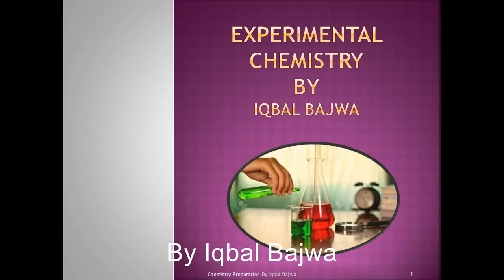Students, today our topic of discussion for O level is experimental chemistry. So you all are familiar with the lab and lab practicals. Today we have to study about the different apparatuses used in the lab.